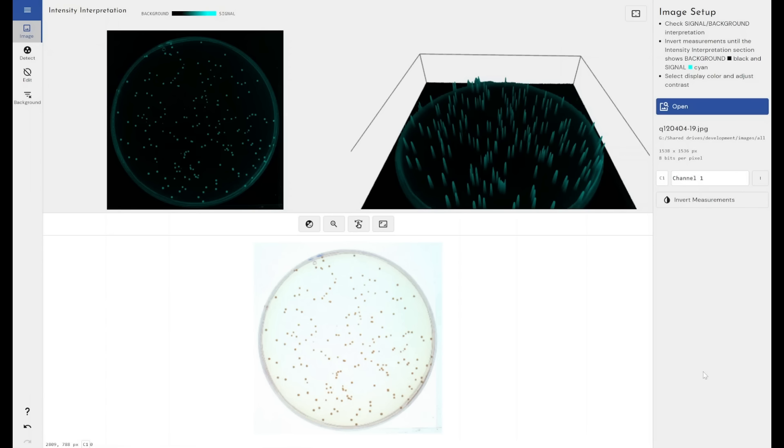It can detect particulates in a water sample for water quality control, or even something as broad as metal filings in a hydraulic fluid sample. At its core, this piece of software massively simplifies and automates the process of detecting particles within an image.